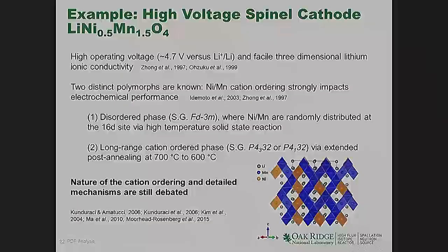The next example is one that looks into cation ordering and the length scale of that cation ordering. And this is actually a study we have completed at the PowGen instrument here at the Spallation Neutron Source. It's a nice high-resolution pair distribution function machine, part-time. It's usually applied to crystallographic Rietveld refinement, and I think Ashvia is giving you a talk. She may even discuss this example.